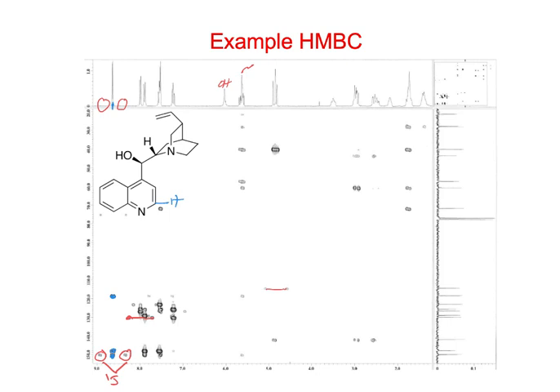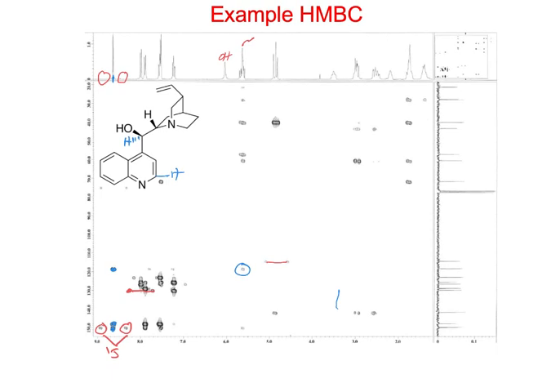So I think in this case, I don't have my notes, but this one is very good at kind of bridging between these two structural parts, the benzene ring and then this bicyclic system over here. So we see some down here and down here. These are probably, I don't know if there's a third one. I guess we only see two to the aromatics, though.